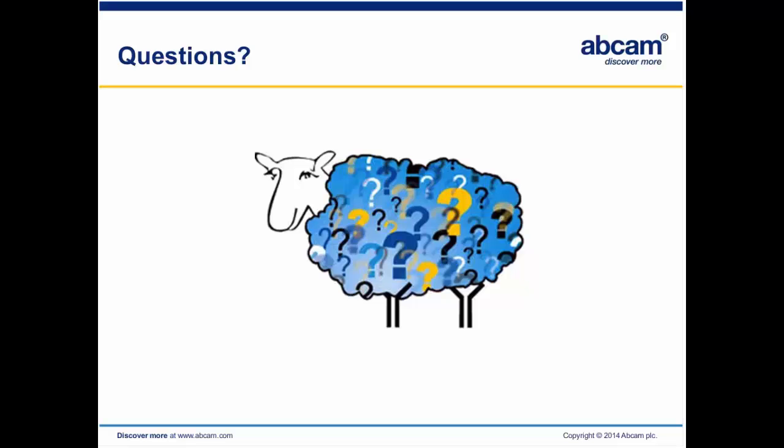And then another question is: what are the differences between reads and peaks? So the read is the raw sequencing read that you get from the sequencing machine, containing the actual DNA sequences and the quality scores. Nowadays, they are usually between 50 base pairs to 100 base pairs.